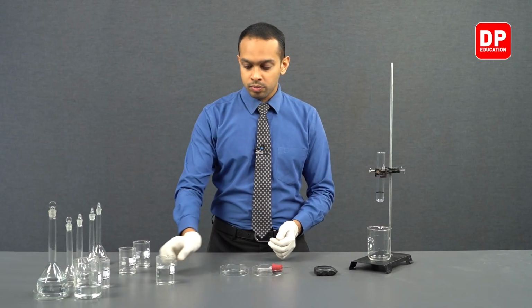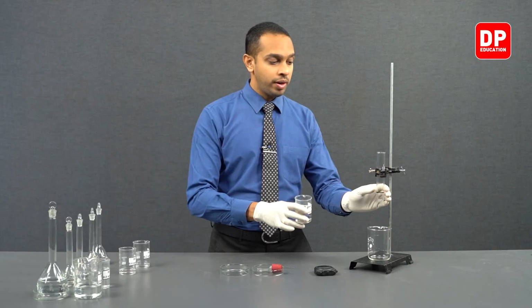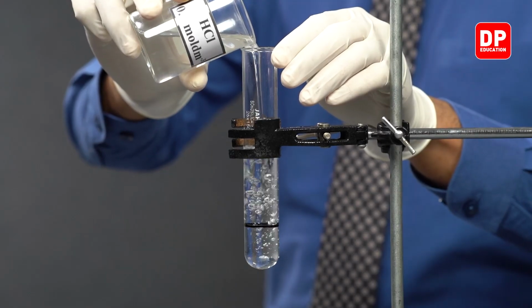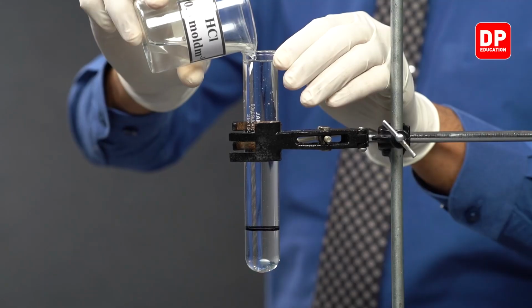and then let's fill the boiling tube that we have with us all the way up to the top. Keep in mind students, you should be filling it all the way to the top.